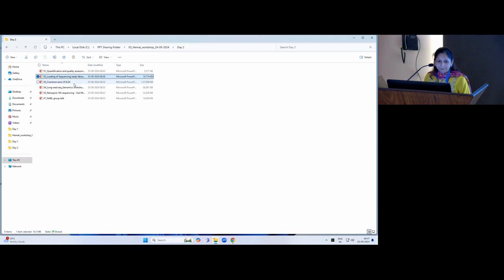Can you explain a little bit? Custom primers mean the libraries that are not compatible with the Illumina read 1, read 2 specific primers. For that, you need to add the custom primer separately into the cartridge so that your custom library will also get sequenced along with the Illumina compatible library. So this is only if you are developing leukemia or other NGS methods.